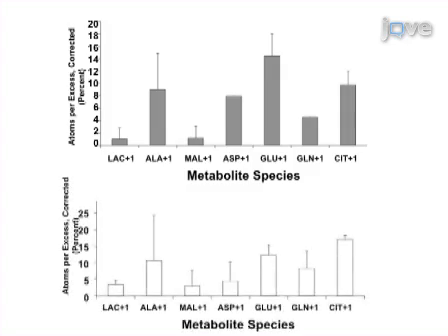Finally, feeding living worms with a stable isotopic precursor, either during development from L1 stage on plates, or beginning on the first day of egg laying as young adults for 24 hours in liquid culture, permits sensitive analysis of isotopic enrichment among metabolites, indicative of flux through glycolysis, pyruvate metabolism, and the tricarboxylic acid cycle.